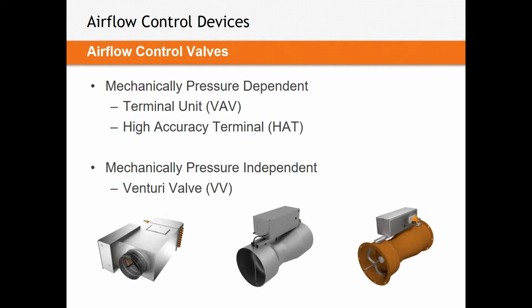Now the goal here in discussing these two, or however you like to look at it, three types of valves, isn't to say one of these types of valves is better than the other. Each one of these types of products has its applications. Each one can be very, very well applied. But again, mechanically speaking, each of them operates fundamentally different. And in a high-speed critical application like a laboratory, that mechanical operation, that actual speed, that performance is of utmost importance. The way these work will determine how our laboratory works.